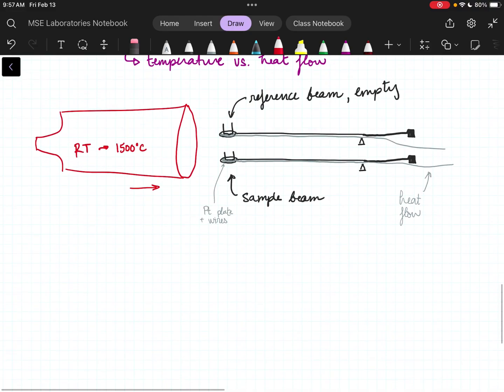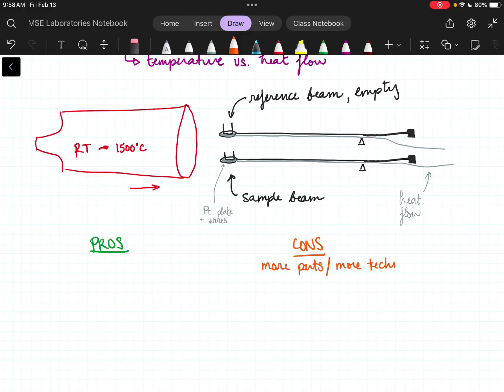And luckily we're already doing all of this, like the weight calibration and things, because the platinum is going to have a different thermal expansion than the alumina. And the platinum expanding and contracting is going to change the way it conducts that heat along it ever so slightly. So we do have a couple extra calibrations that we do in order to make this system work. But this is what we actually have: two combination DSC TGA instruments, and this is their general setup here.